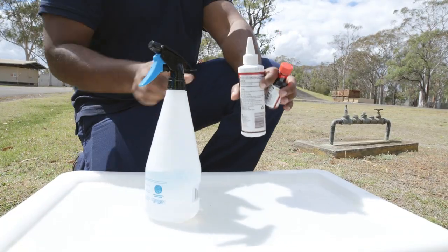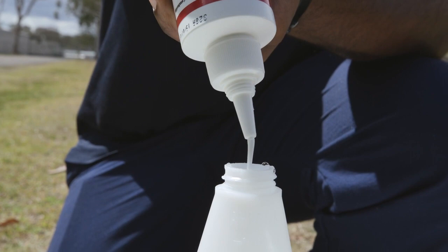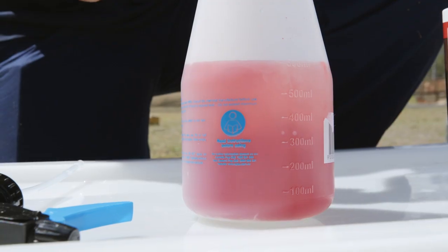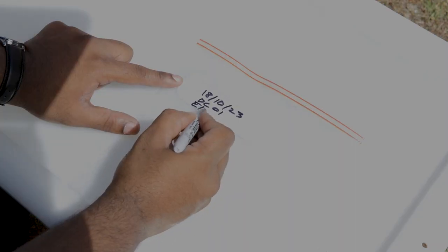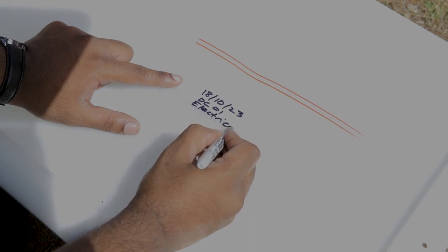Mix PVA glue with water in a 5 to 1 ratio. The use of colouring aids in the glue provides a visual indicator of coverage. Label the sampling bag with details such as date, location and type of material sampled.